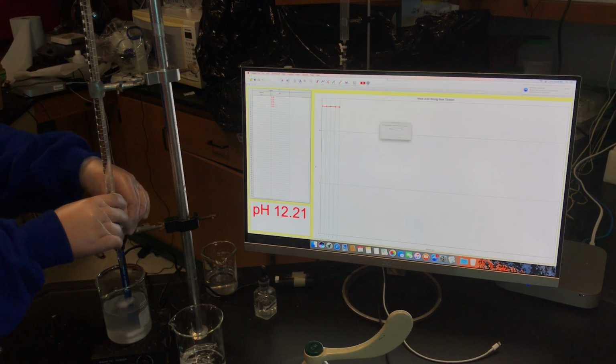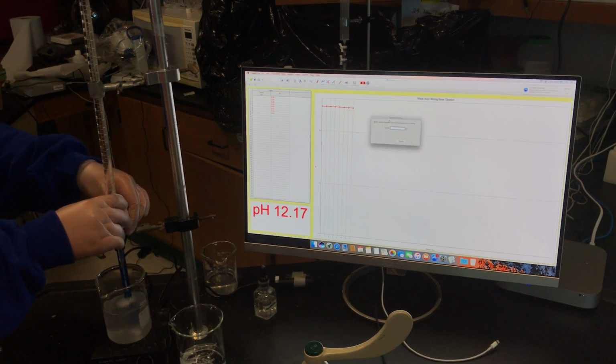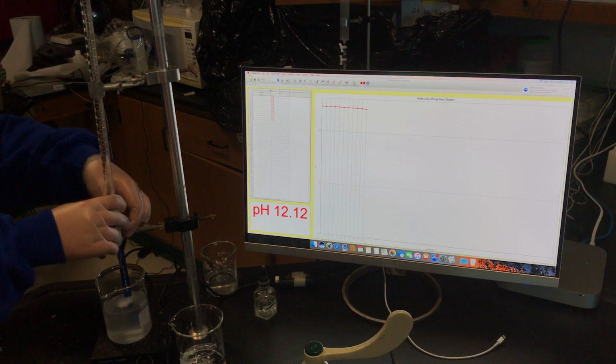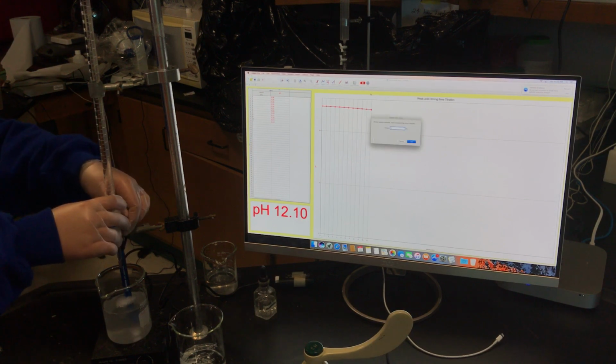Here we go. Good teamwork here. Remember, we expect 25. We're only at 5. And again, we do expect that the tablet will say what it is. So I do expect that we'll get around 25 through all of this hard work.